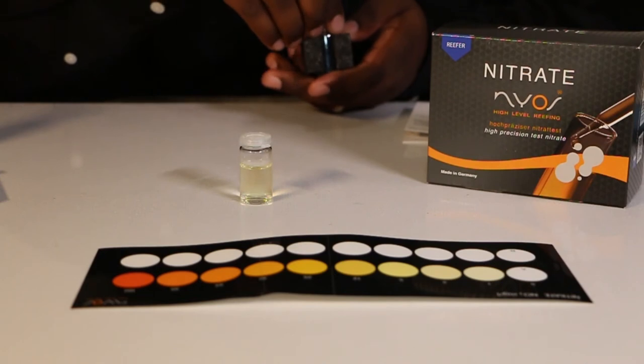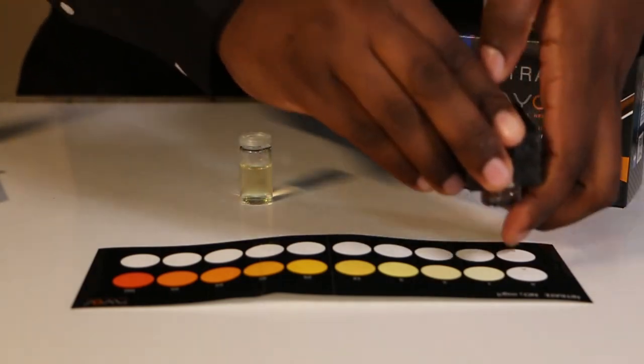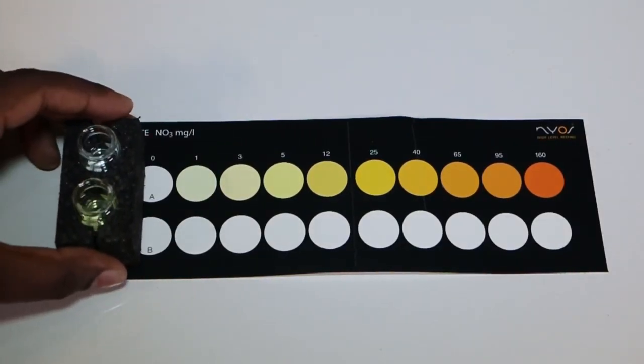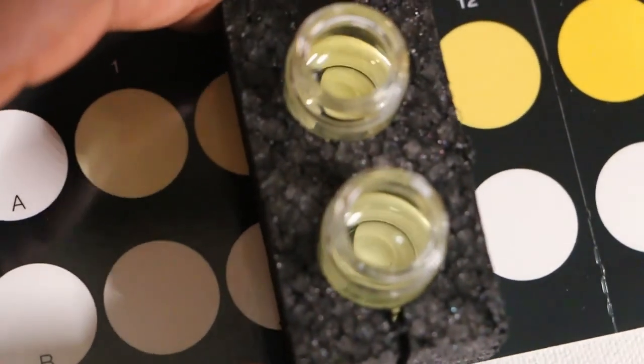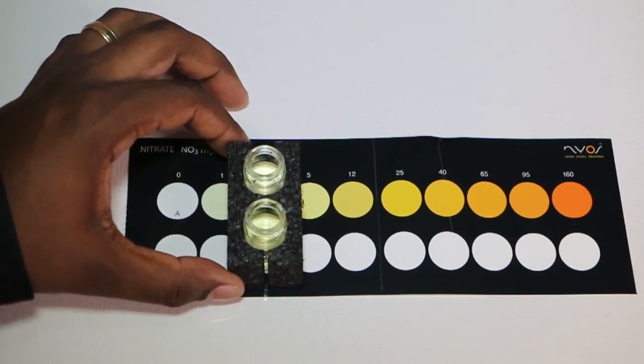Our five minutes are up! Place both vials in the holder. Put the vial with no reagents over the color chart and the other vial on the blank side. This test was really easy to read — I'm guessing it's due to the extra colors available. It seems my nitrate levels are between 3 and 5 milligrams per liter.